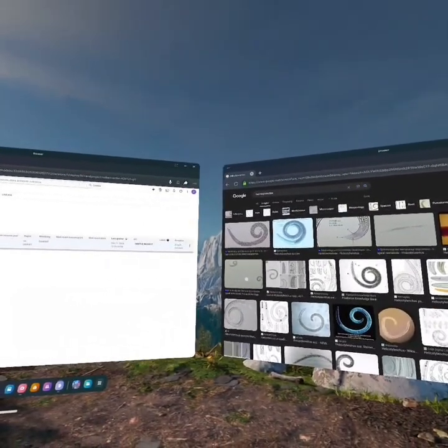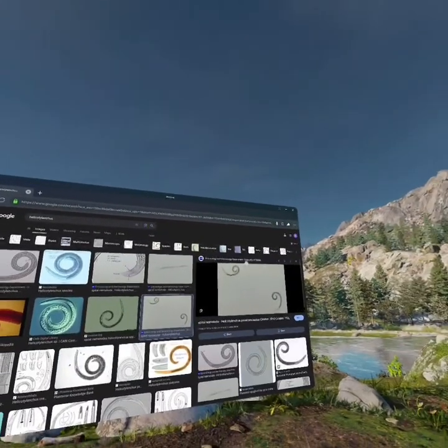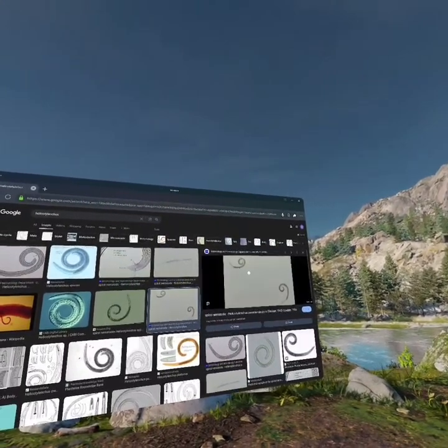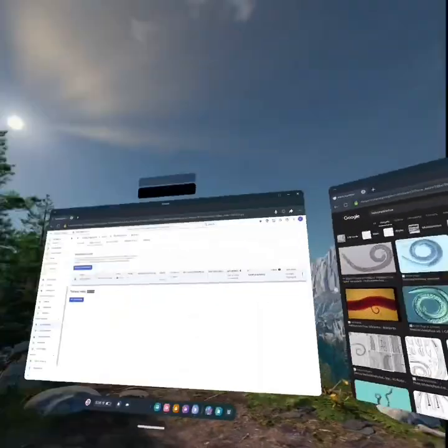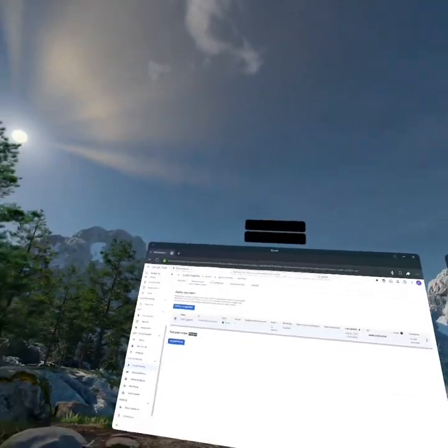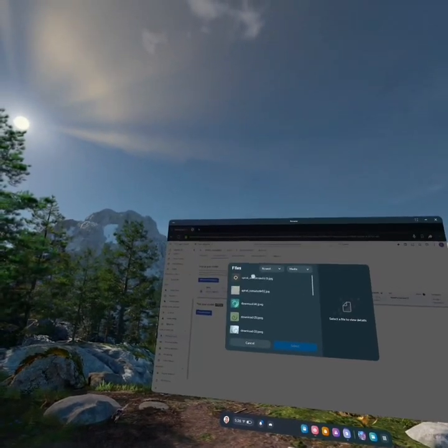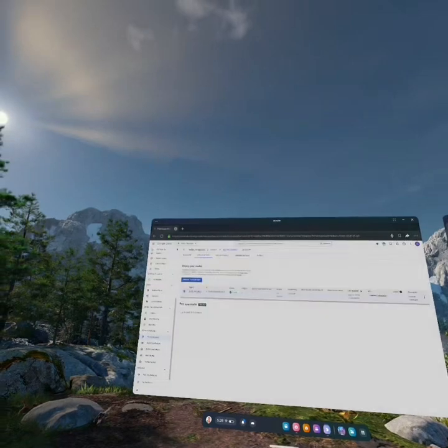What's that? Entomology and Nematology Department. All right, download, whoops. Oh, Lord, I don't know where it is. Download image. There we go. Oh, whoops, downloaded. Upload. Select.